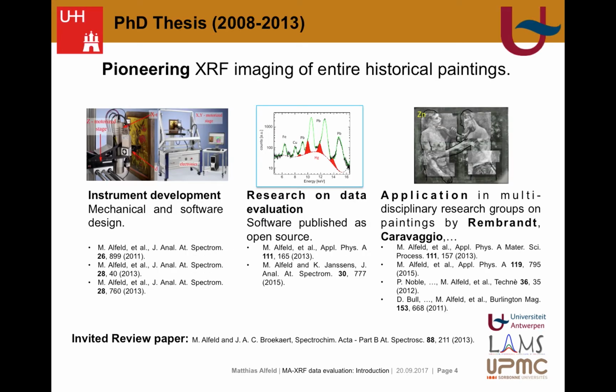My PhD thesis, which I did from 2008 to 2013, mainly at the University of Antwerp in the group of Janssens, pioneered XRF imaging of entire historical paintings. I did not do the first scans, but I developed the first practical mobile instruments, involving the mechanical and software design.